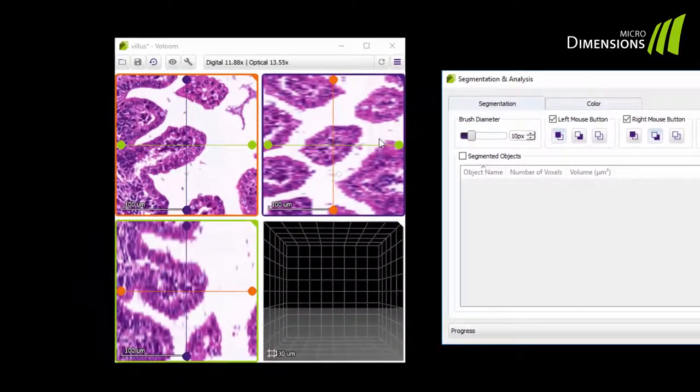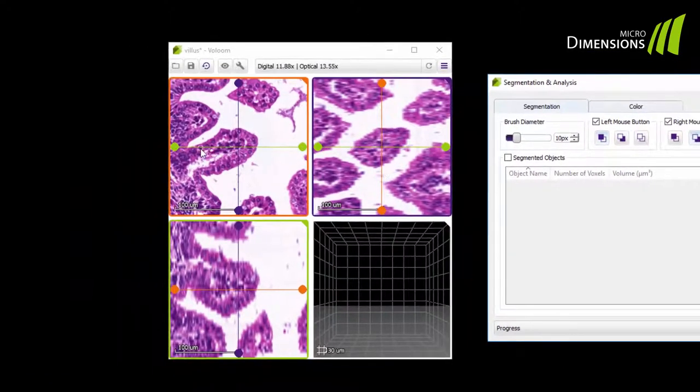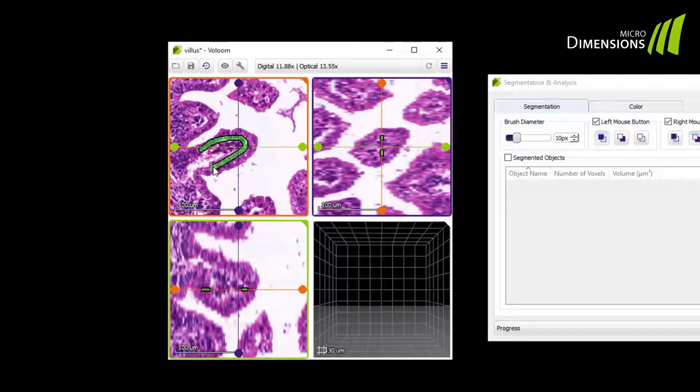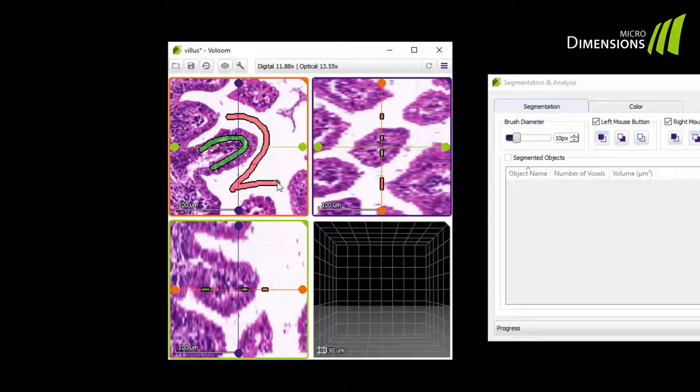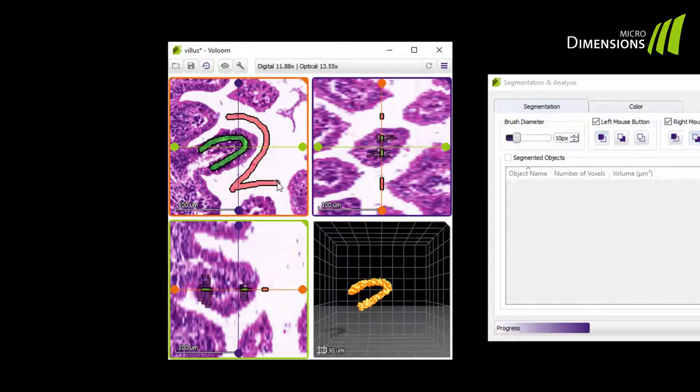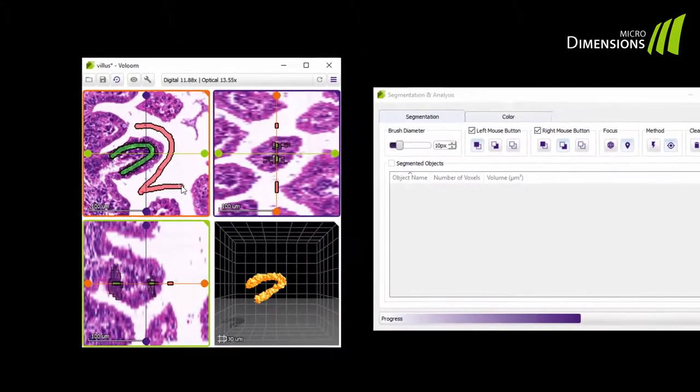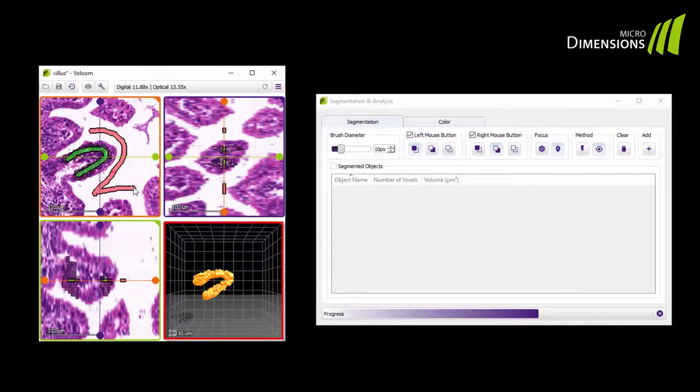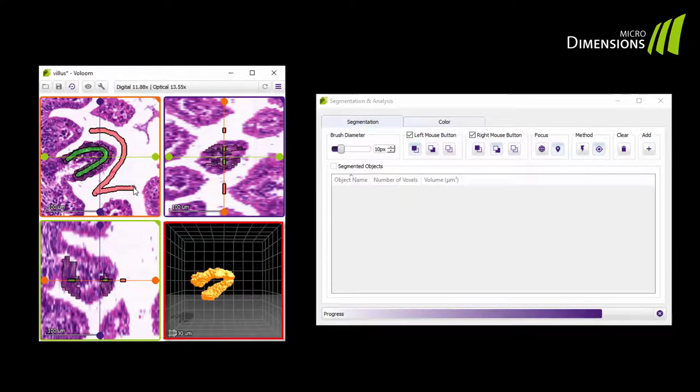Now let's go back to the villus segmentation. With the left mouse button I brush the region I want to segment. With the right mouse button I brush the background. I am done brushing and now you can already see that the segmented object is growing in the lower right-hand window, where usually the volume is rendered.